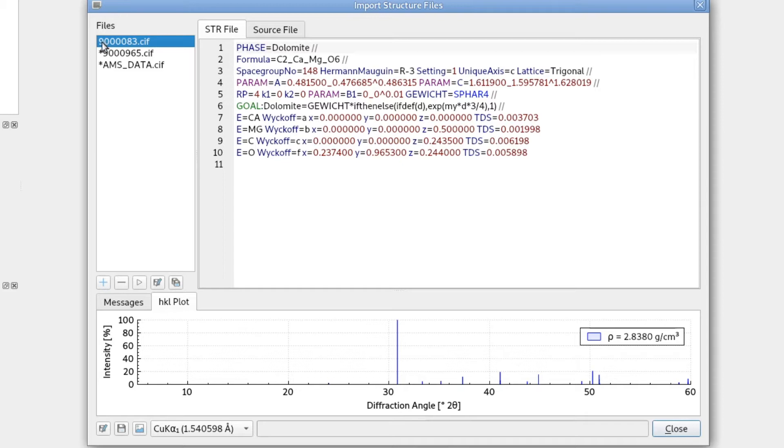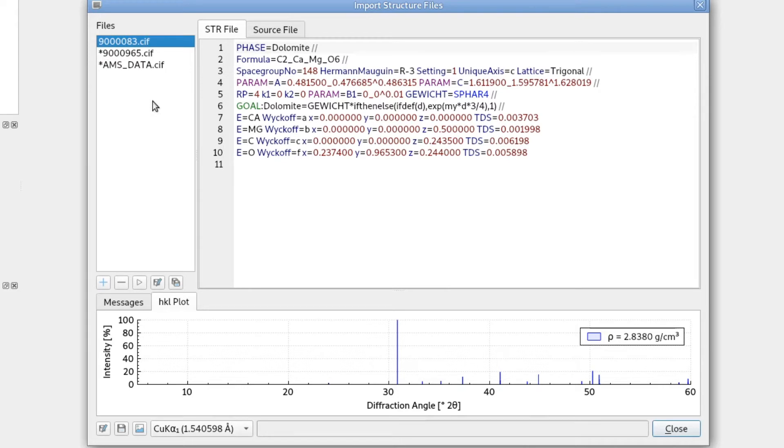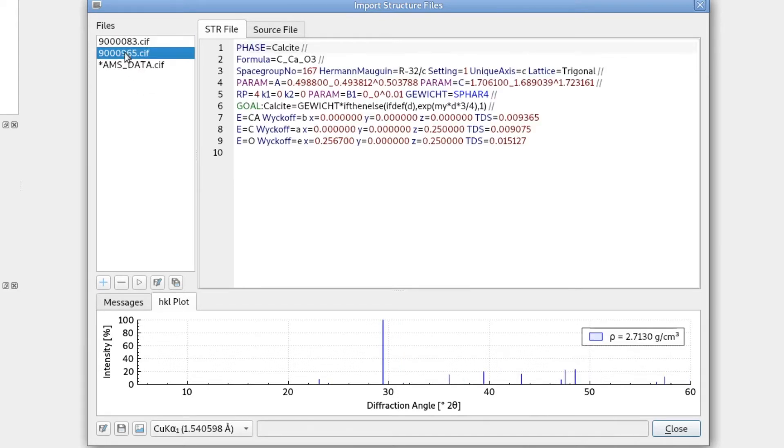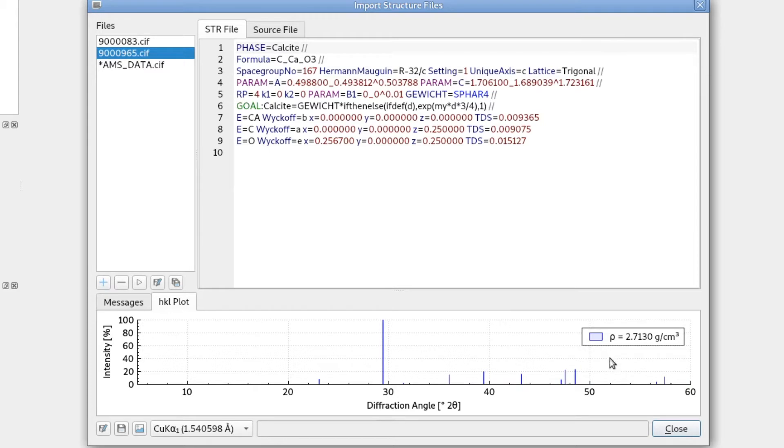Here we also see no asterisks in front of the file name. So this means this file was verified successfully. The other two files still have the asterisks, so they were not verified yet. But as soon as we click on them, it will run verification. And if everything goes well, we will see the stick pattern here and also the density.